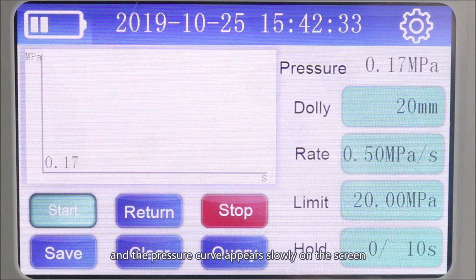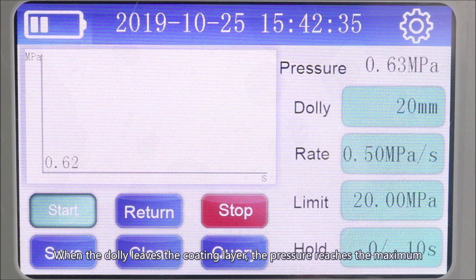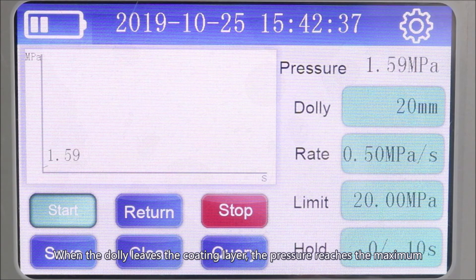The pressure curve appears slowly on the screen. When the dolly leaves the coating layer, the pressure reaches the maximum.